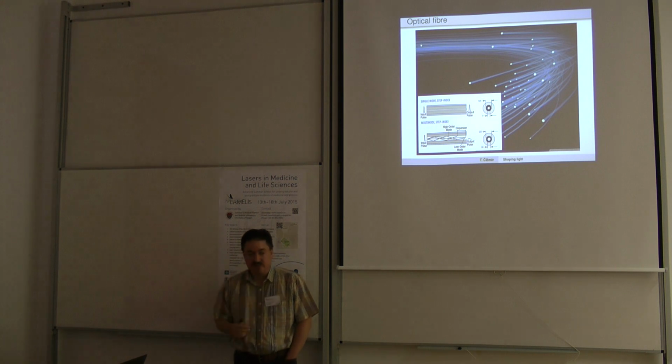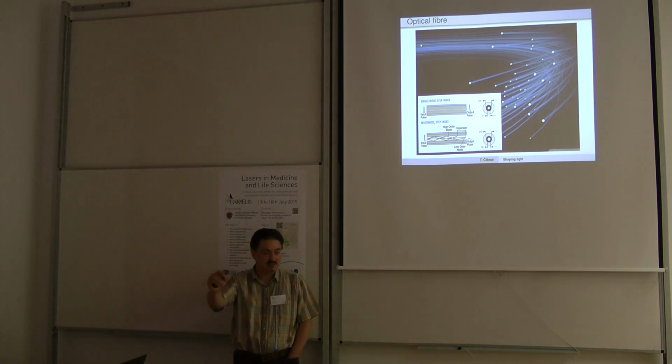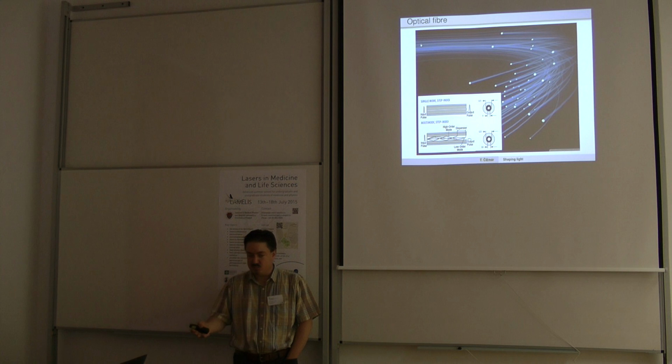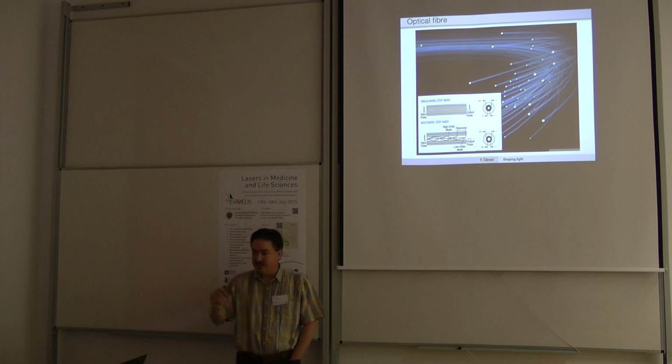But you need the probe, you need the guide star, right? Somewhere inside, in situ. So imagine that you would be trying to do imaging in the brain, you would have to introduce some kind of guide stars in the brain, right? Fluorescent particles that are isolated, right?